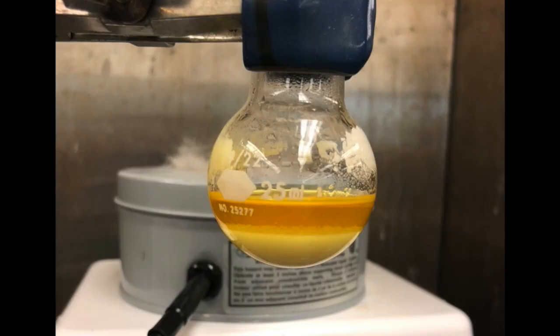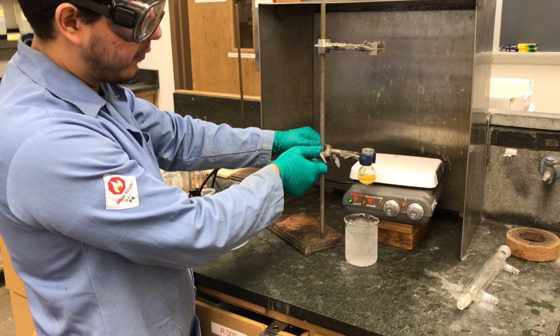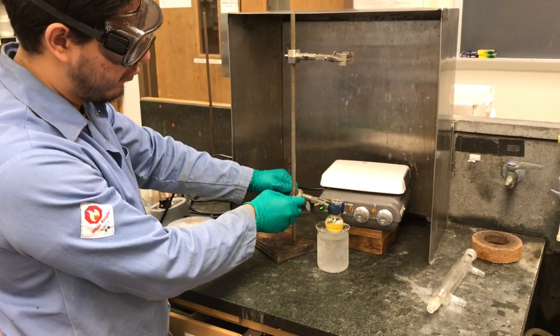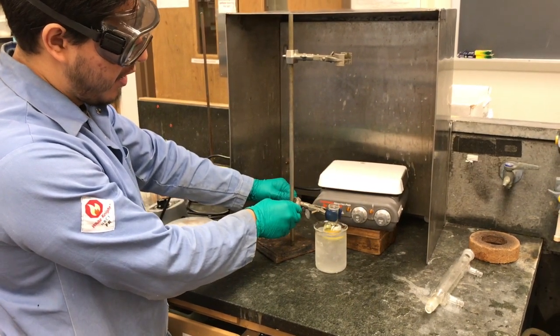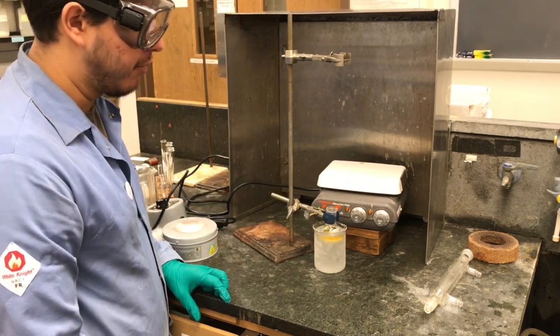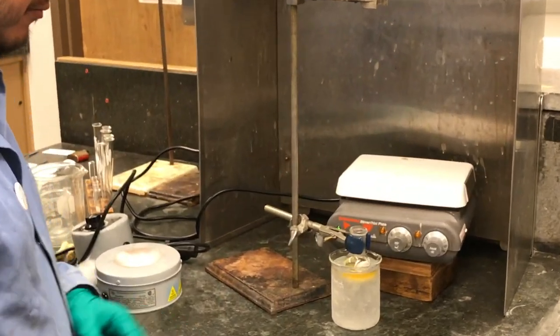So now we took it off the reflux and let it cool for a bit. You can see that there's a bunch of solid at the bottom, and that should be our product. Our product should precipitate during the reaction. Alright, so now that we finished the reflux, we're going to put it on ice for about 15 minutes. And hopefully that allows all of the product to precipitate so that then we can filter it out afterwards.